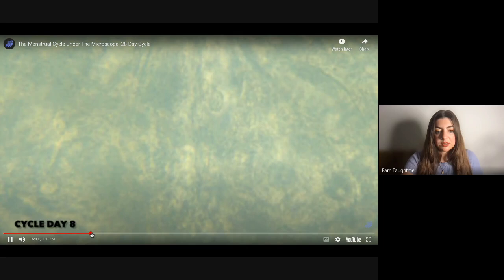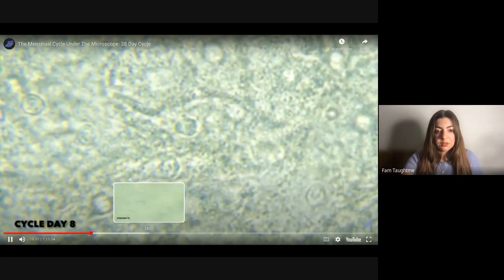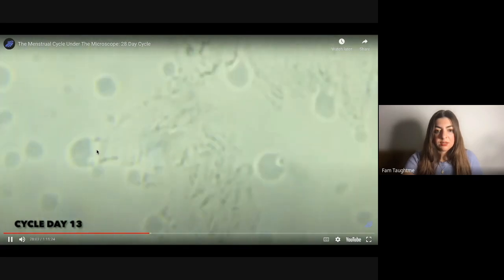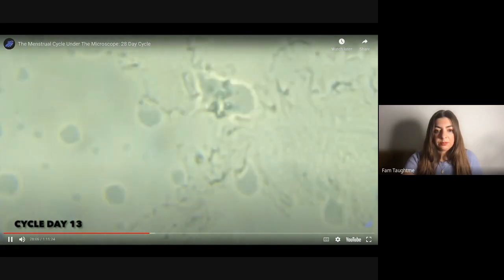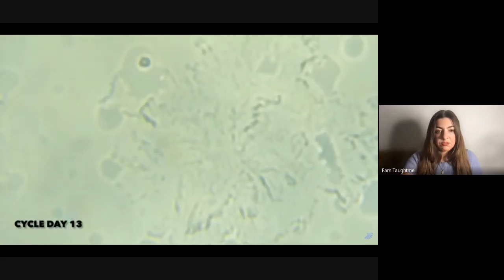So let's see, I can skip through a little bit. It's pretty fun to watch and see me sliding over some of these interesting looking forms.